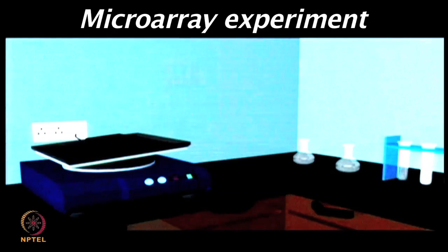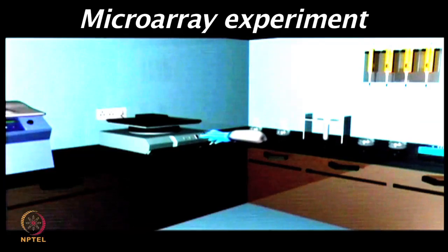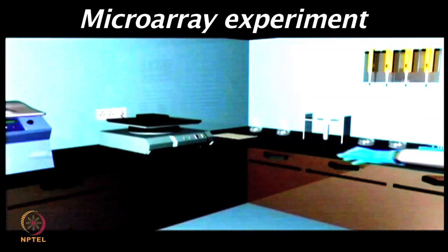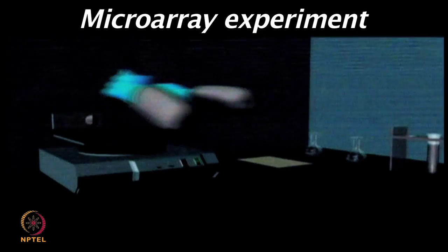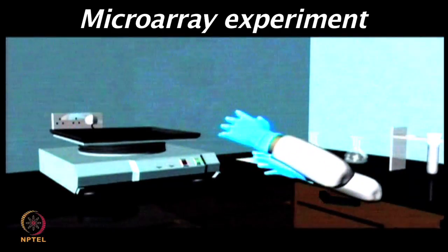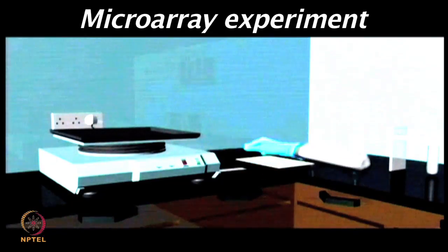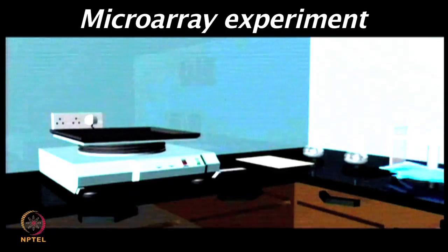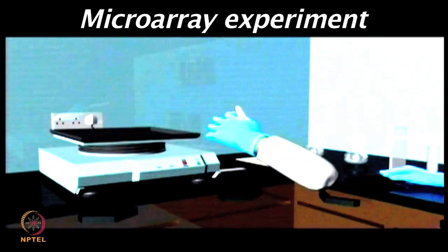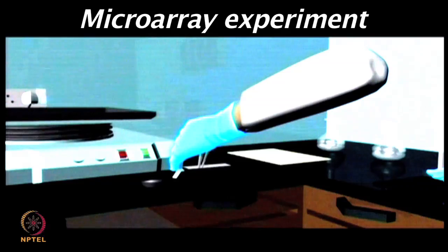After the blocking step is completed, remove the slide from the blocking solution and tap it against a paper towel, so that one can remove the excess milk. As I mentioned, one needs to ensure that there is continuous mixing of the slide, because if it is left sitting on the rocker without mixing, then the slide will dry and it will appear dark when you are scanning for the different types of features.